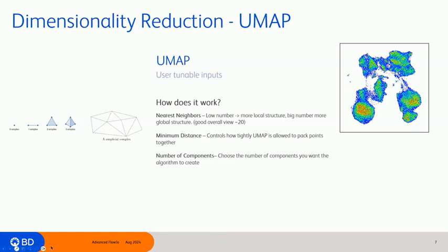With a nearest neighbors of something low, like 2, we see that UMAP merely glues together some small chains, but due to the narrow view, it fails to really see how those connect together any further. This represents the fact that from a fine detail point of view, the data is very disconnected and scattered throughout the space.